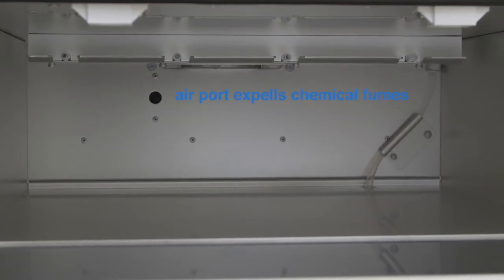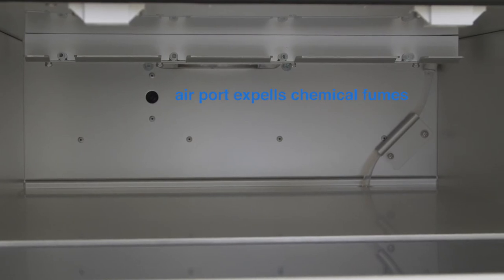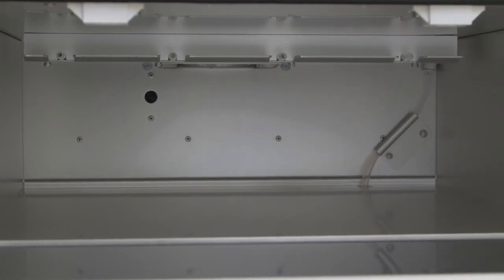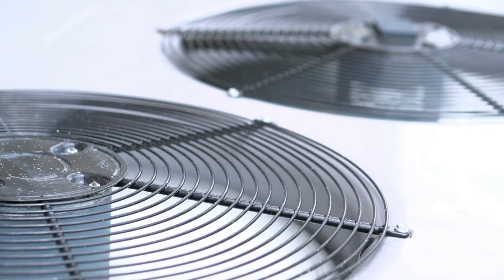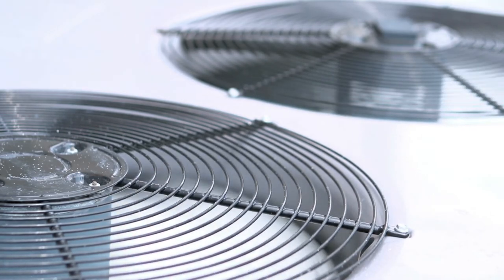The back wall of the oven has an air port to expel the chemical fumes sent through the carbon filters. The fans are constantly degassing the oven. With the door closed, the fans run at a constant speed. When the doors are open, the fan speed will increase to minimize fume exposure to the user.